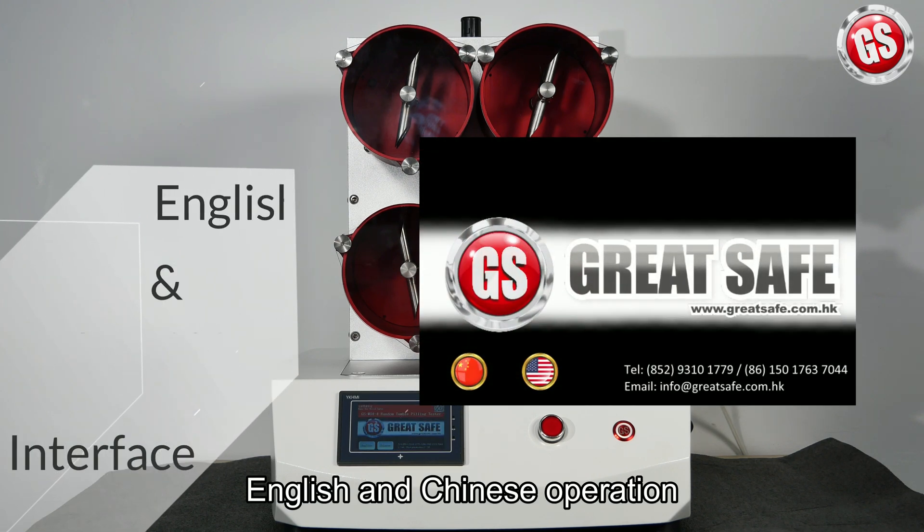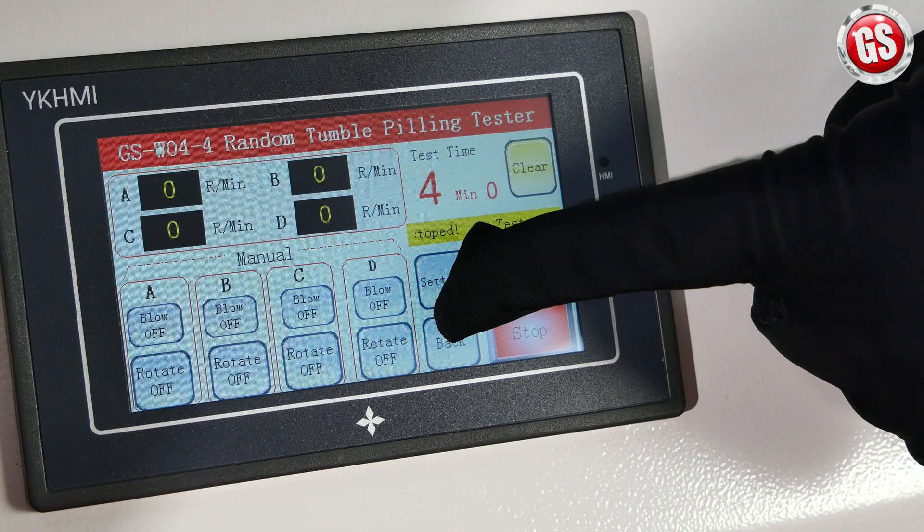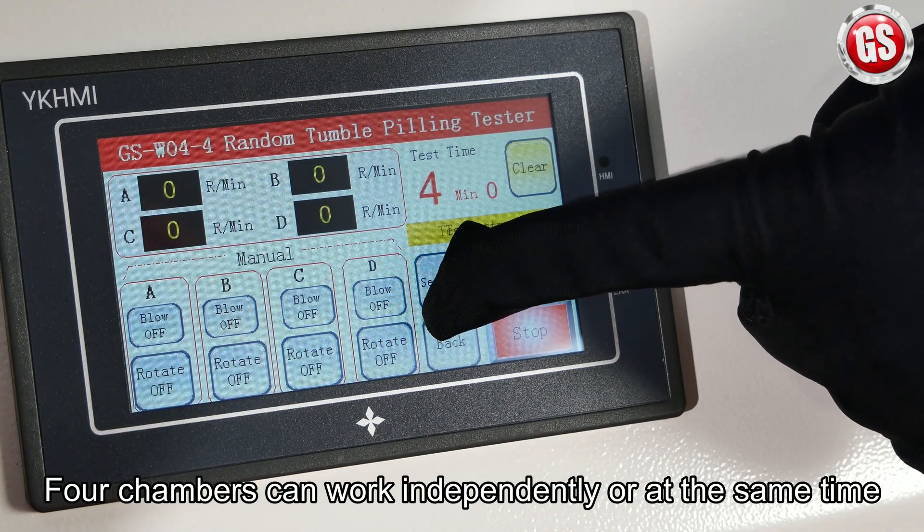The smart control system has English and Chinese interface. Four chambers can work independently or at the same time.